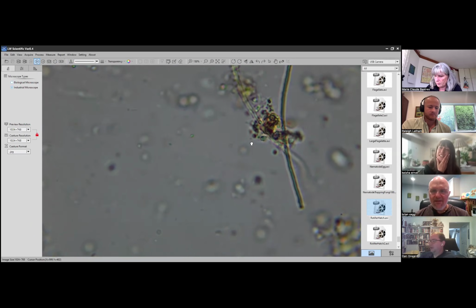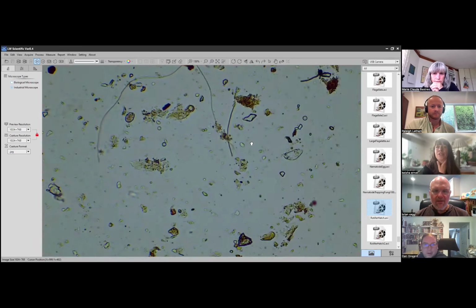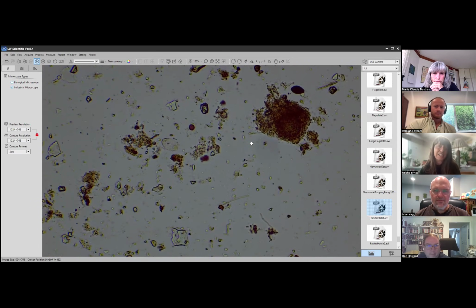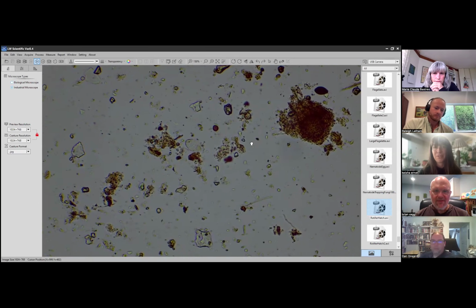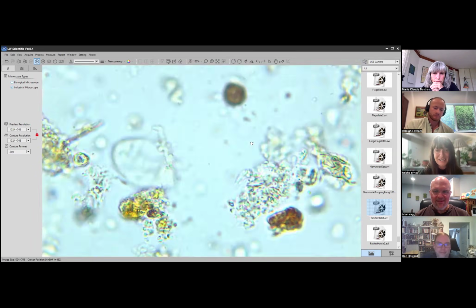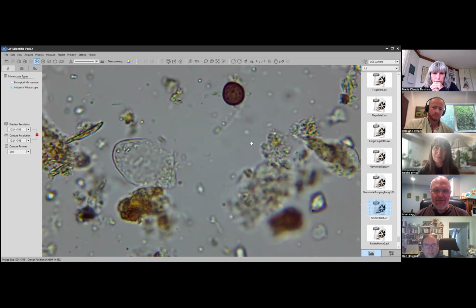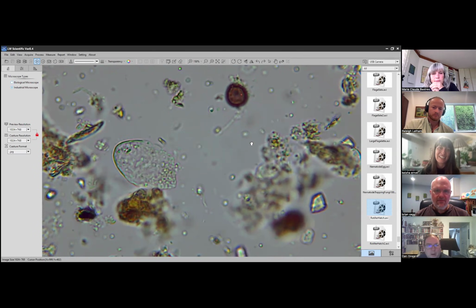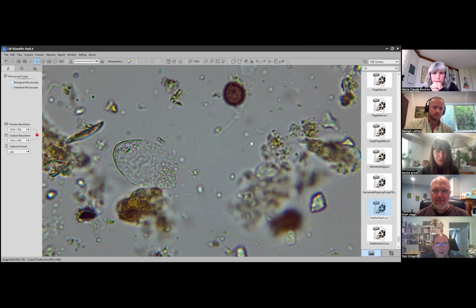Someone else asked, what happens during the winter? Like what's going on with the microbes when there's snow on the ground? Do they just disappear? I think you can see here that some of Dan's bacteria are quite active, although they've been warmed up for a little bit inside. Fungi is still growing in the winter. There's still microbes happening. When you get under the ground, it's not as chilly as it is up in the air. So there is still some work happening with these guys when it's cold.